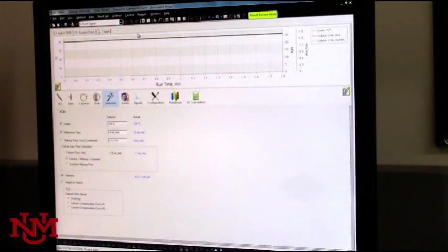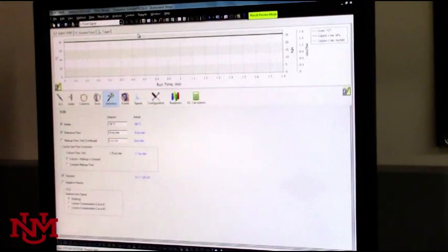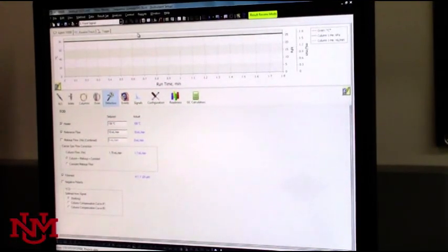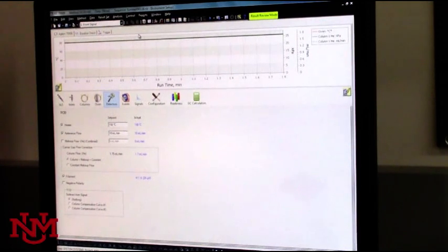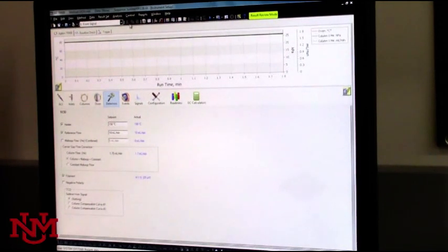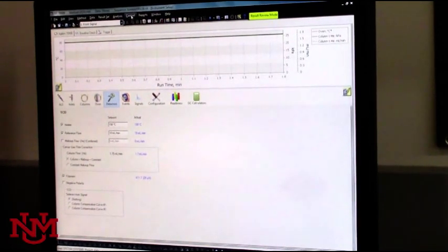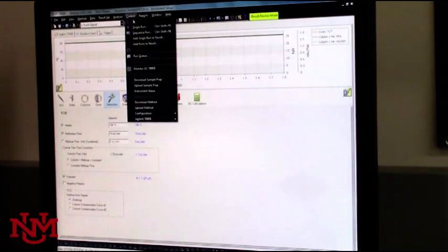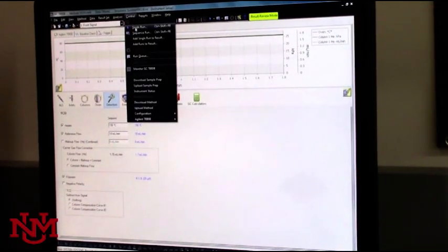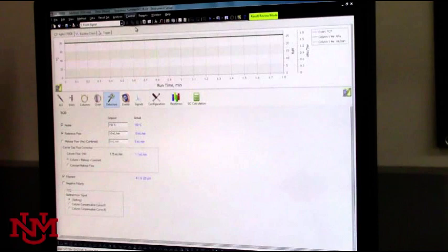All right, so how do you actually use the GC? You go to the screen and you go to control. You click on control and click on single run.